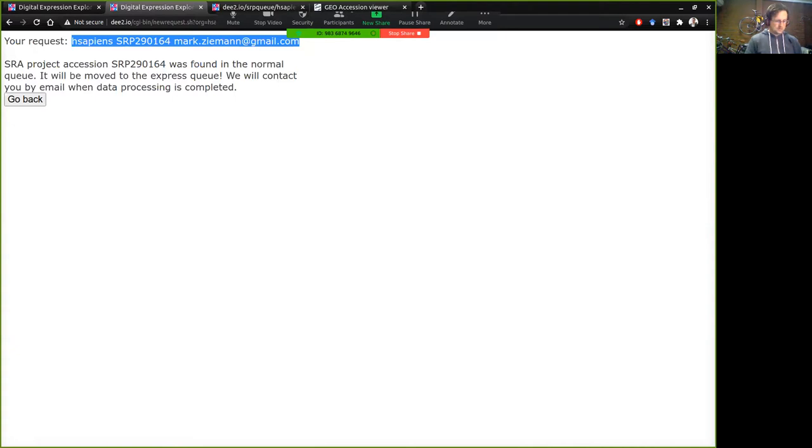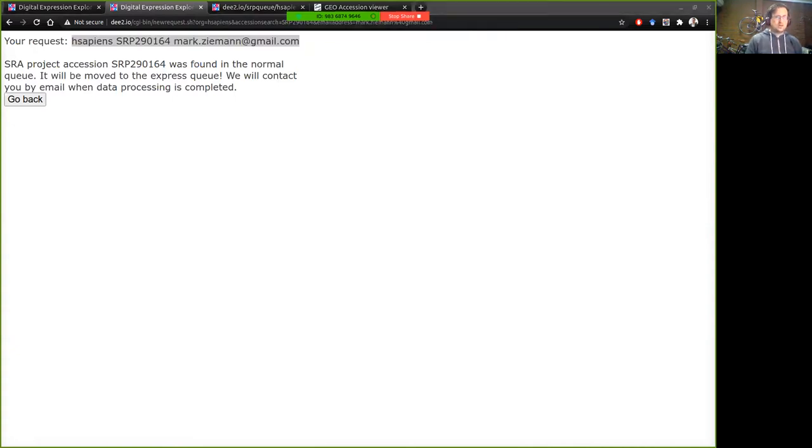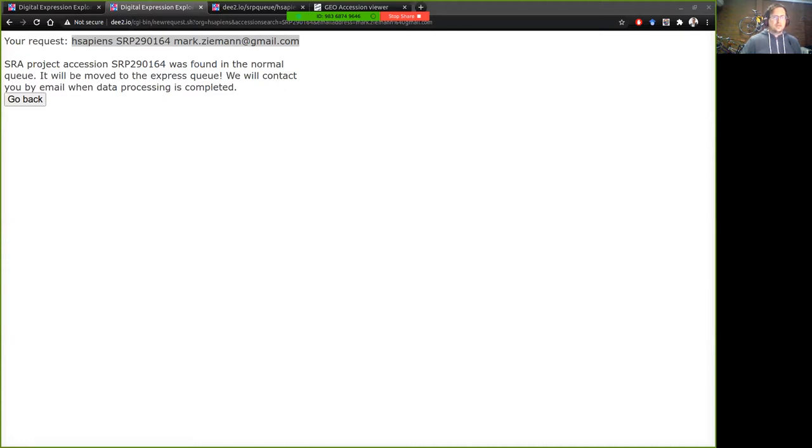Okay so what does it look like when you get the email notification? So what I'll do is I'll bring one up for you to show you what this looks like.